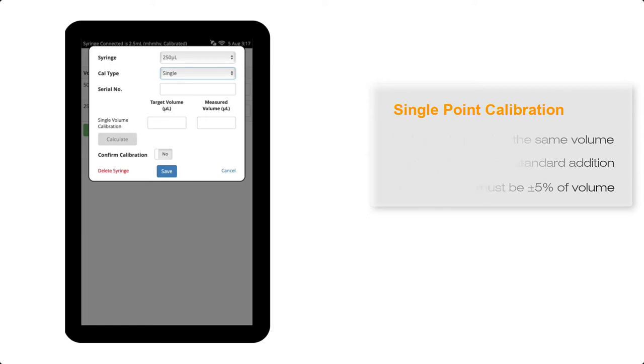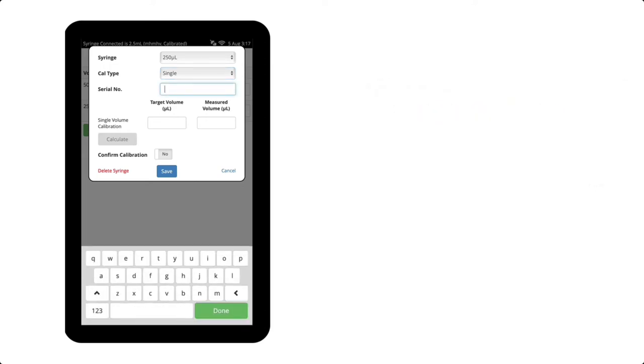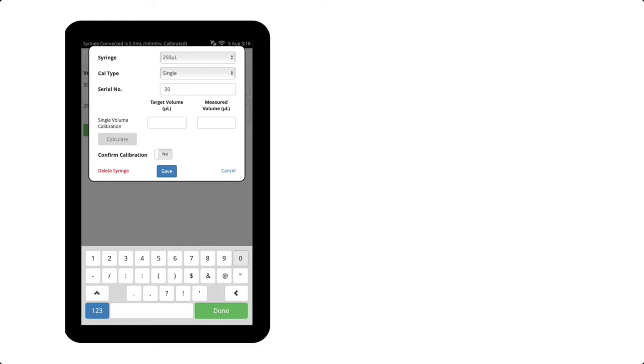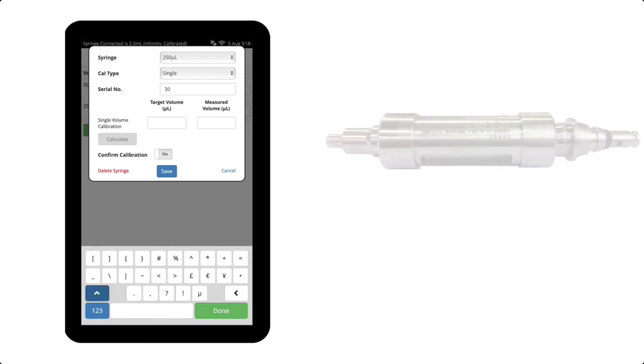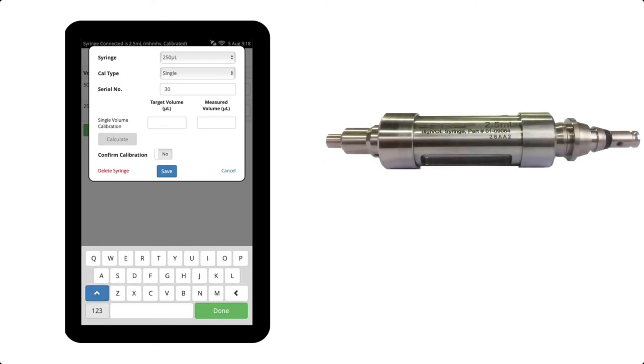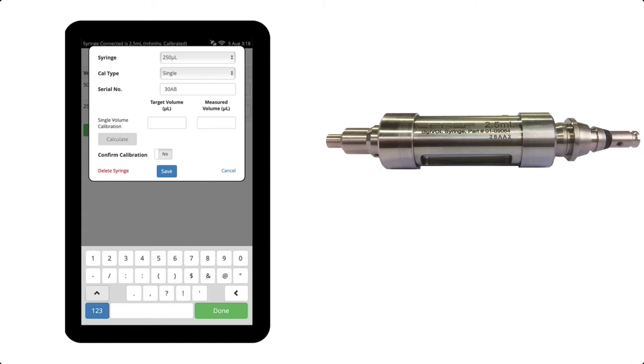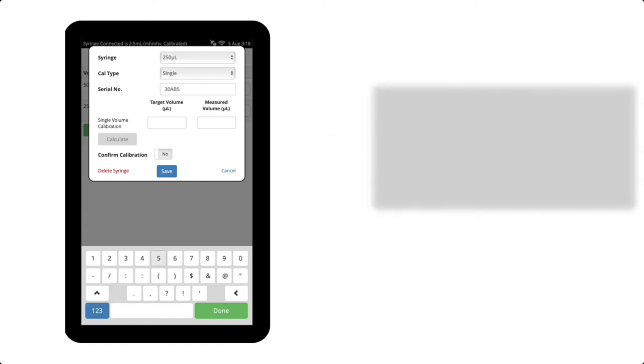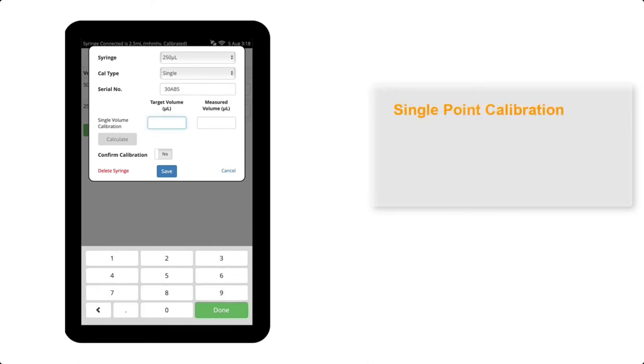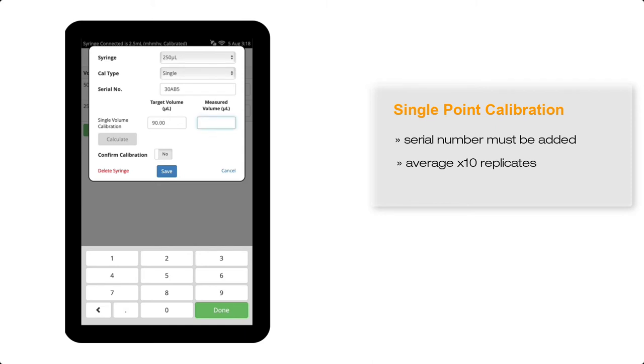In this case, I'll enter the serial number of this particular syringe, which is 30AB5. Each syringe has a unique serial number which is located on the barrel of the syringe. I'm going to calibrate this syringe for a single target volume of 90 microlitres, and the measured volume averaged from 10 replicate weigh-ins on a five-figure balance, and adjusted for density is 89.95 microlitres. So I'll enter this value into the measured volume field.